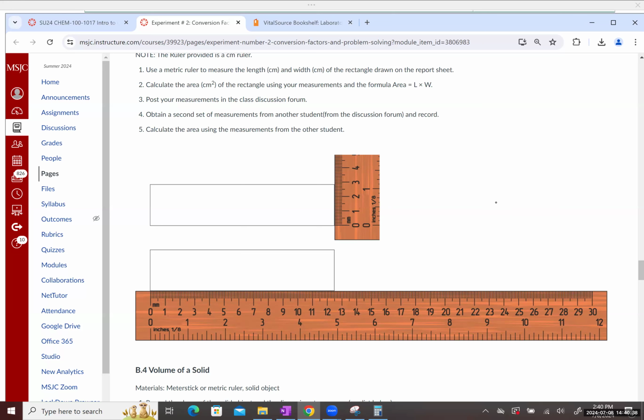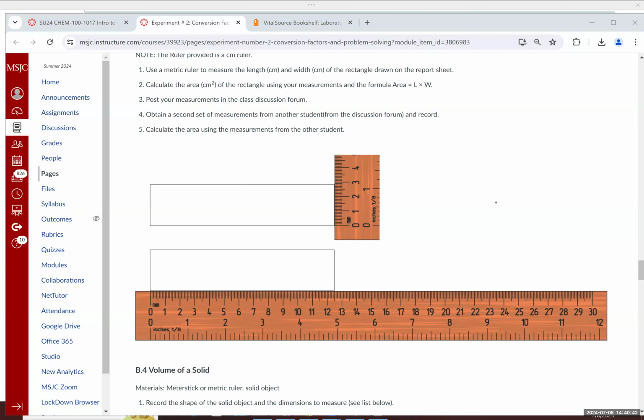Okay, so let's take some measurements now. And you're more than welcome to use the measured values that I'm collecting right now as another student's measured value. You're going to see some variation in the measurements, and that's more than fine. Okay, so first and foremost, as I'm dealing with a ruler, to go from 0 to 1, to go from 1 centimeter, it takes us 1, 2, 3, 4, 5, 6, 7, 8, 9, 10 ticks.